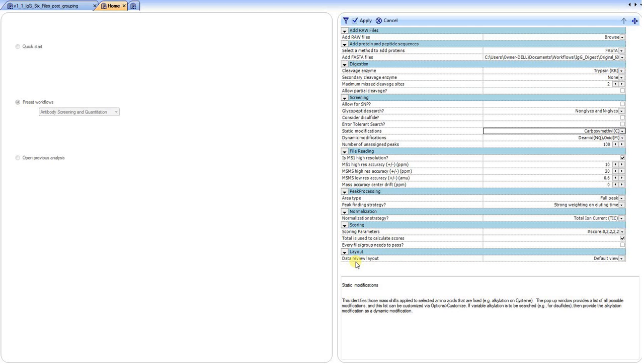The example that we're going to show today is an IgG digest, tryptic digest, that was prepared in 3 different conditions: a control, high pH, and then exposed to hydrogen peroxide. And there are 2 technical replicates for the particular group. And I've already processed the 6 raw files for both qualitative and quantitation, and it took about 3 to 5 minutes to get that completed.